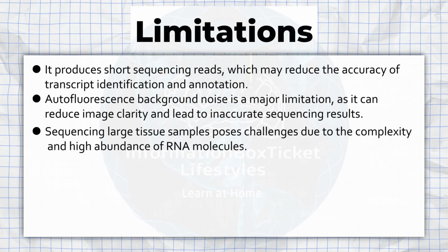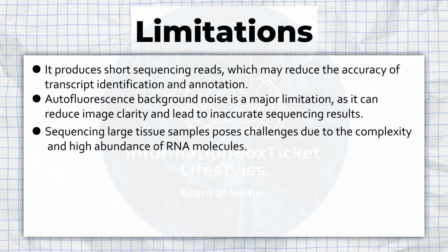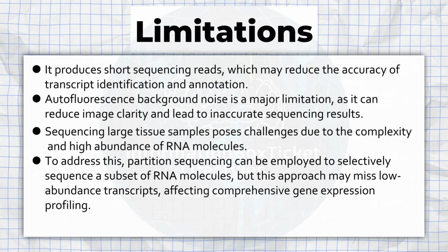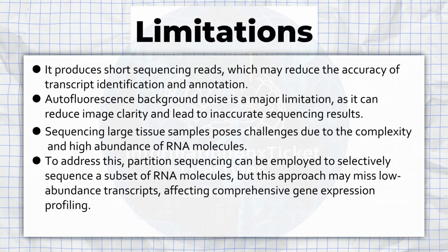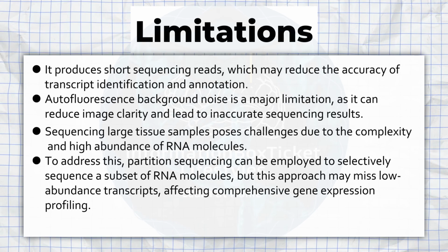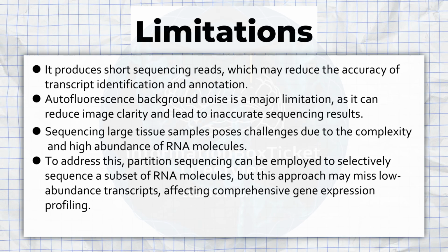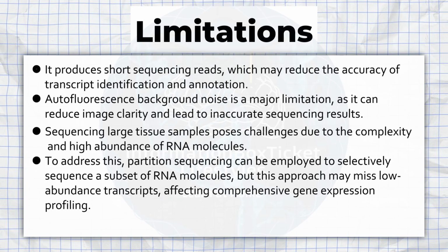Sequencing large tissue samples poses challenges due to the complexity and high abundance of RNA molecules. To address this, partition sequencing can be employed to selectively sequence a subset of RNA molecules. But this approach may miss low-abundance transcripts, affecting comprehensive gene expression profiling.